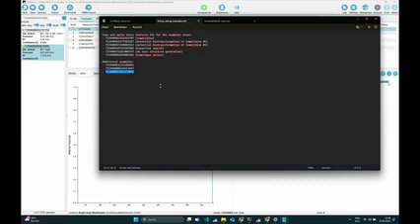So, the elements that are in the auto detection list, you can just leave as auto detect. Specifying them on your own is usually only necessary if we cannot auto detect them, or if you're particularly sure that something has to have a certain element.